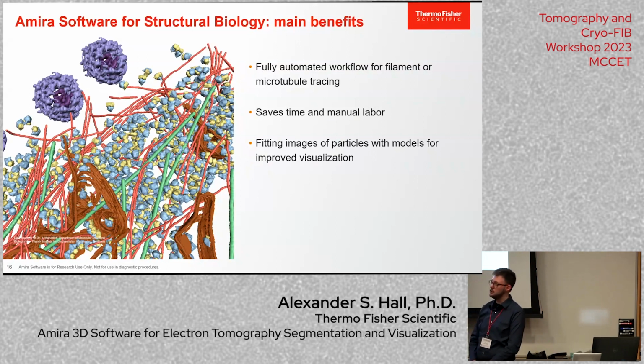The illustration is done in Amira, but their coordinate space was found using a particle picking software of some kind. So if you take a note of whoever asked that question, if they want to follow up with me or someone in Thermo, we can see if that's something we should be incorporating into the software more directly.